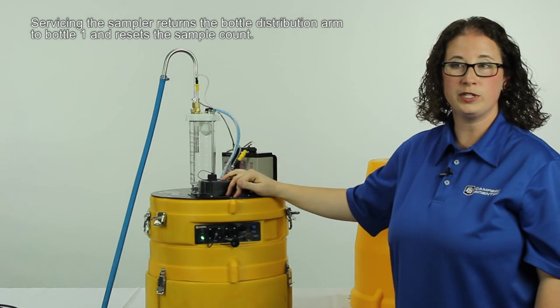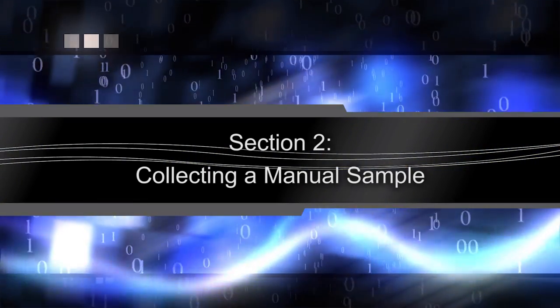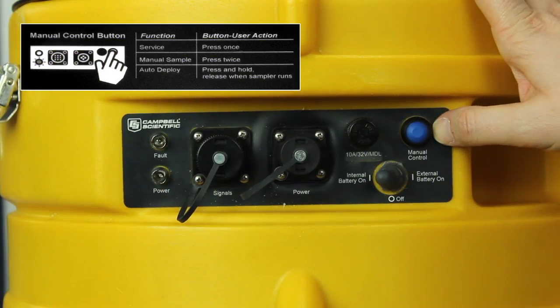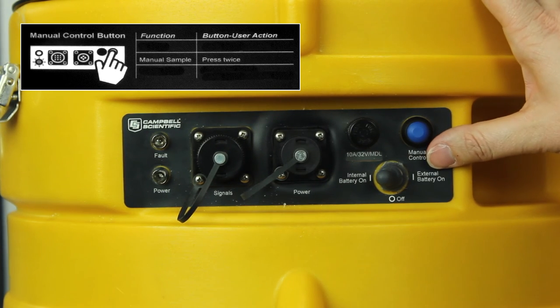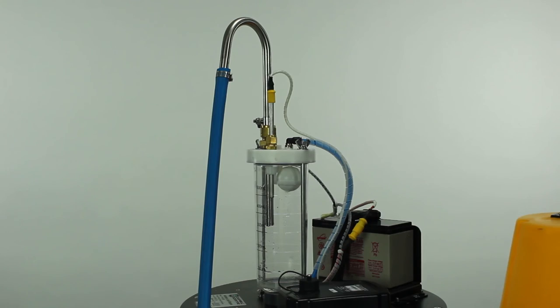To collect a manual sample, you push and release the manual control button twice. So we're going to do that right now. One, two. This time the sampler will run a much shorter time because we've already set all of the purge times and vacuum times.